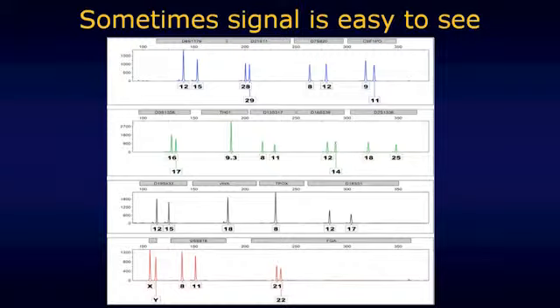And it's not a problem unique to DNA profiling and interpreting of electropherograms. Many people have had to wrestle with this business of distinguishing between signal and noise long before people were concerned about doing it in the context of DNA profiling. The signal in an electropherogram is pretty straightforward. It's the peaks. It's the peaks that arise from the DNA that was amplified during the PCR amplification process.